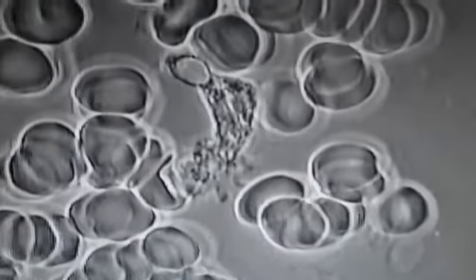So in this blood, the white blood cells, even though they are active — you can see this one moving around — and in its tail you can see it has consumed a large circular disk of yeast.